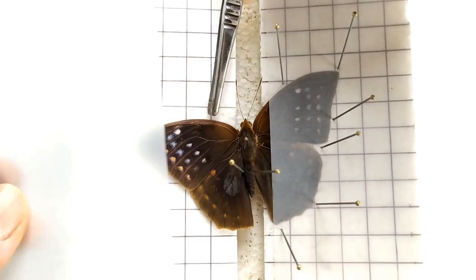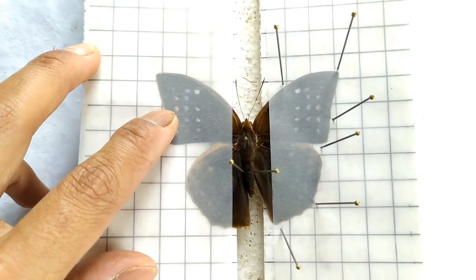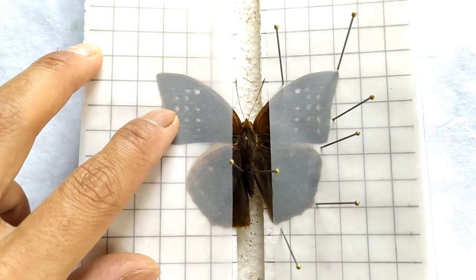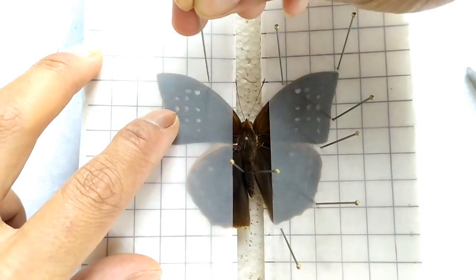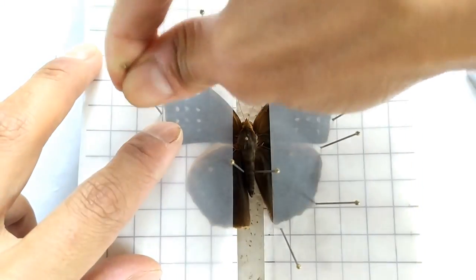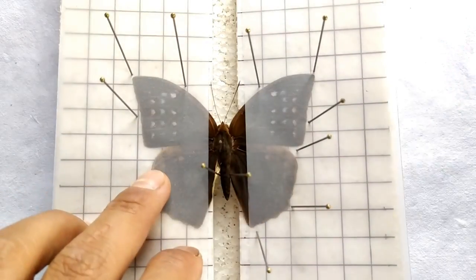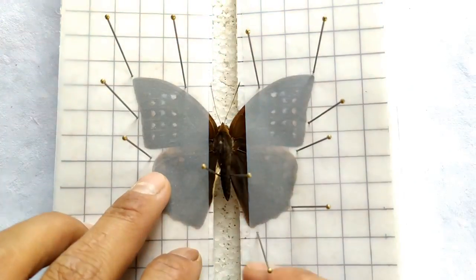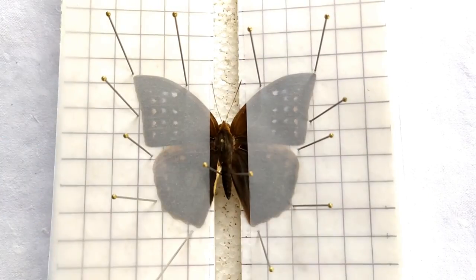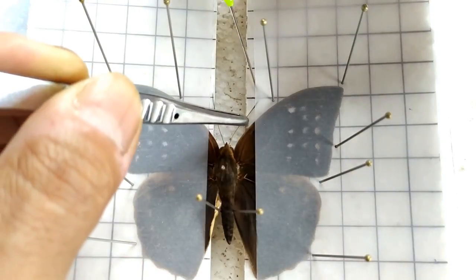Do the same with the wings on the other side. Then position the antennae using pins and tweezers on both sides.